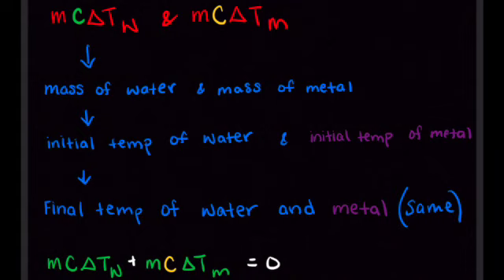Here's an overview that represents the entire lab, or an abstract, if you will. In the lab, the mass of the water was determined and the initial and final temperatures of the water were determined. The specific heat capacity of water is in green because it is a known value, so it was not determined in the lab. You might have noticed that the temperatures of the metal are in purple. That's because they were indirectly measured through the temperature of the water that the metal was in. So that's just a kind of way to represent that.